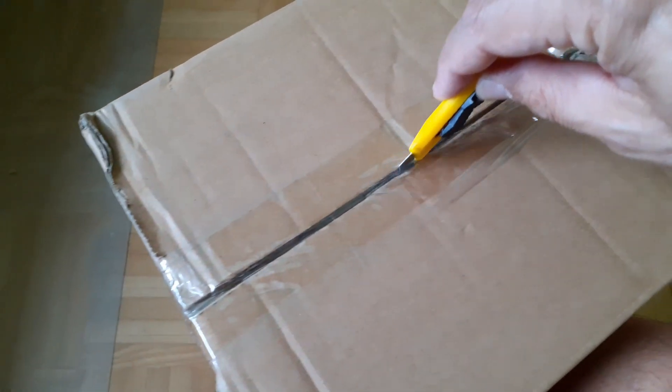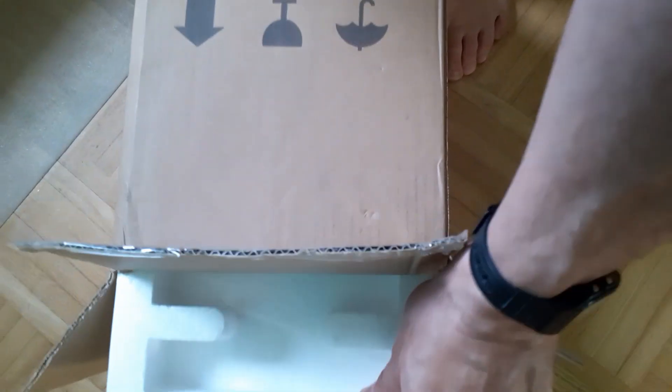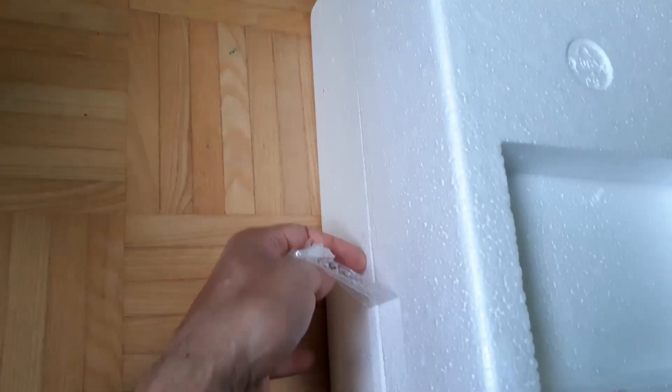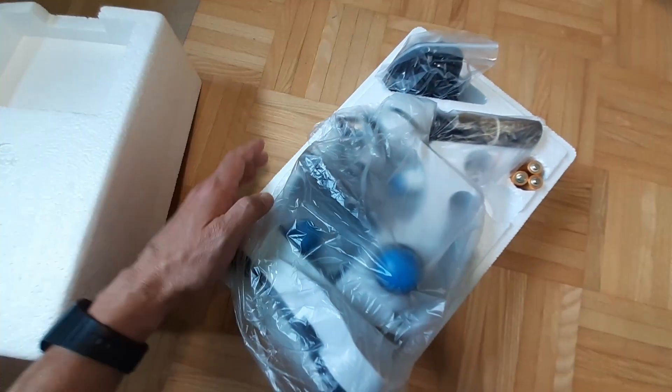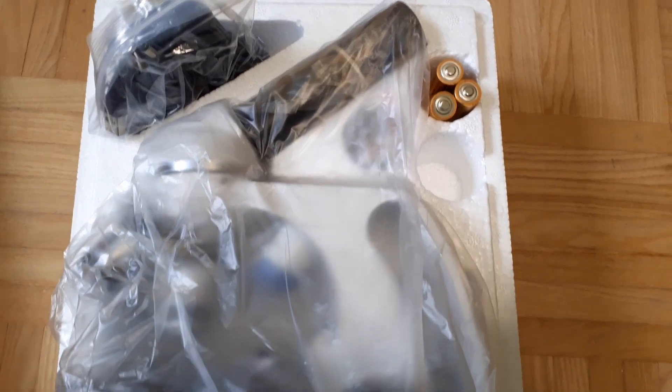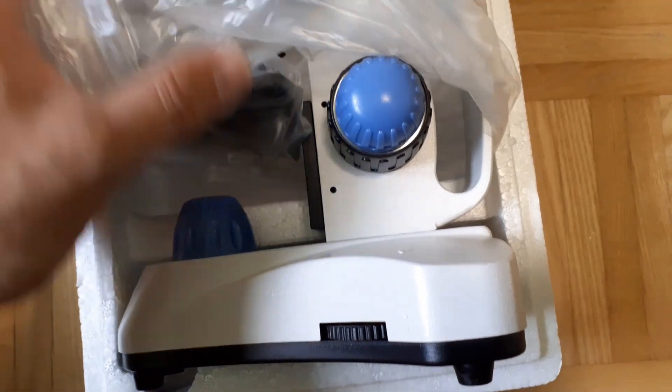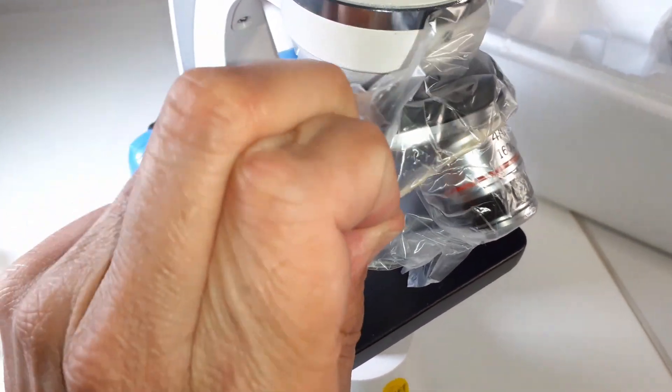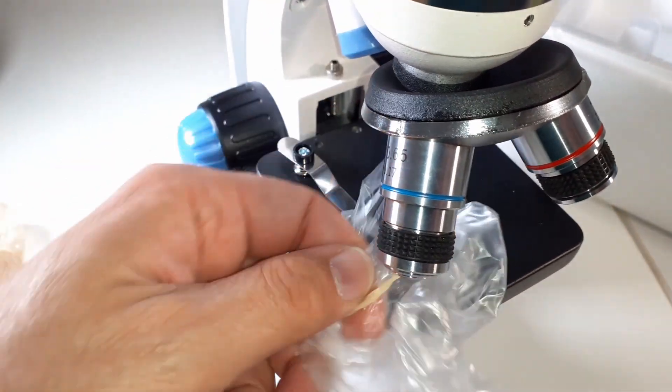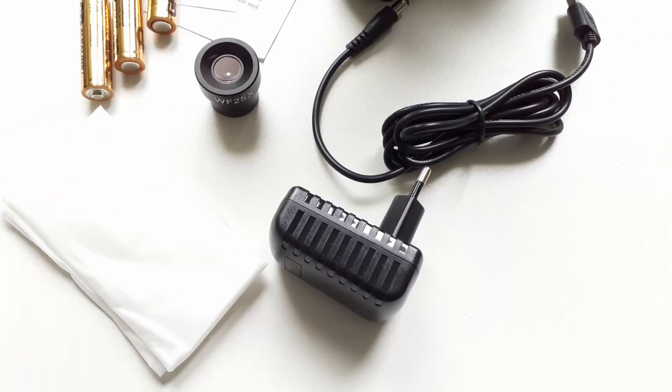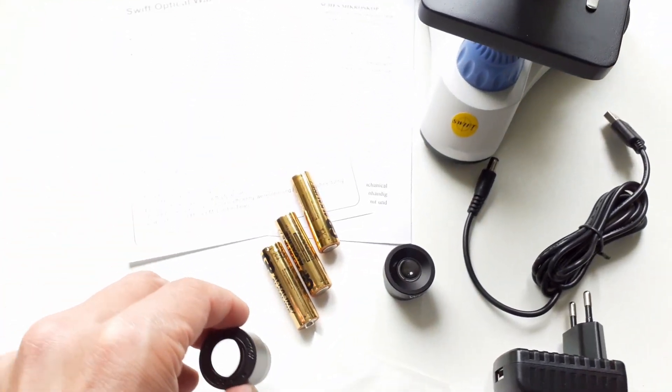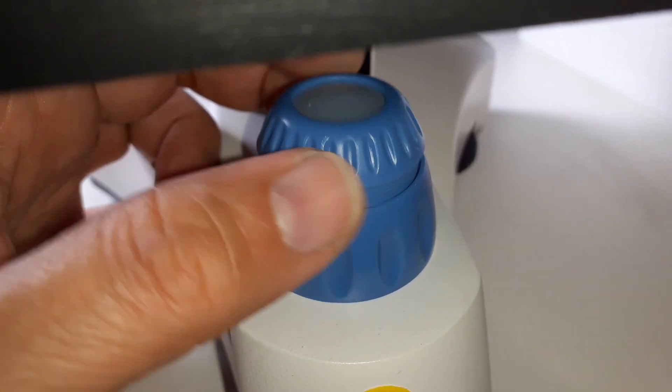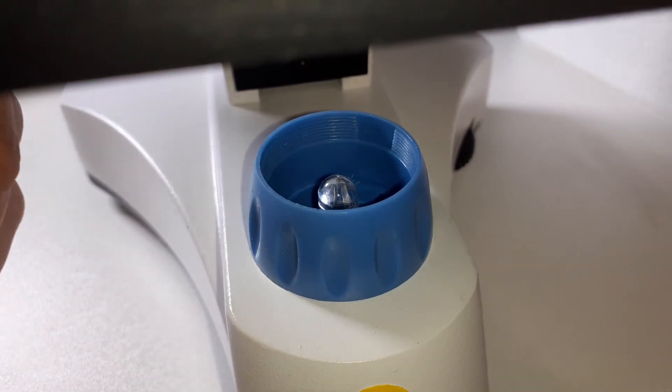Let's start opening the box. Well there is of course a warranty and also a short instruction manual in there. You have to turn the box around, this is the top side, that's important. You don't want the microscope to fall out when you open it. This is how it looks like, everything's nicely wrapped and packaged and it makes a very nice and good impression. So let's have a closer look now. This is the microscope in the box, it does feel a little bit like Christmas.